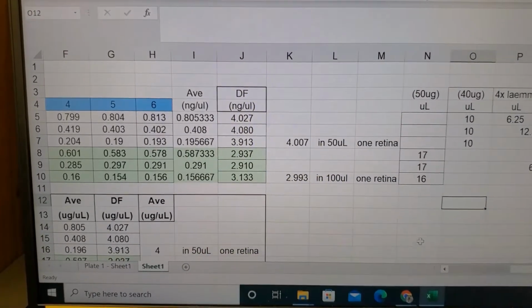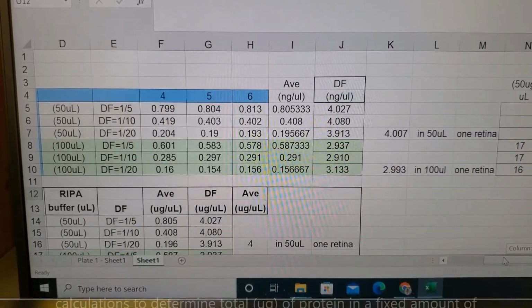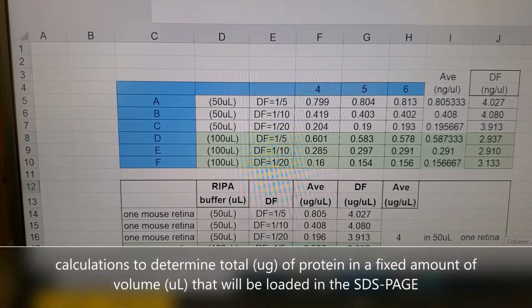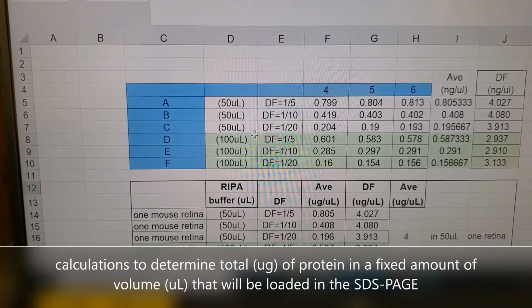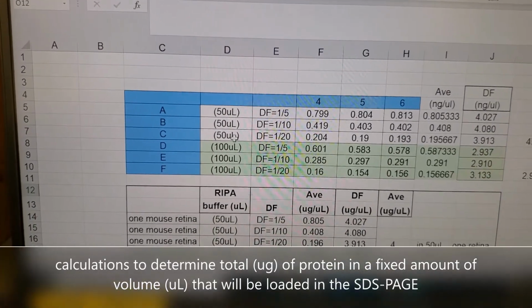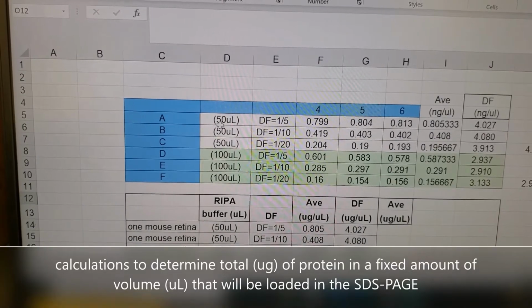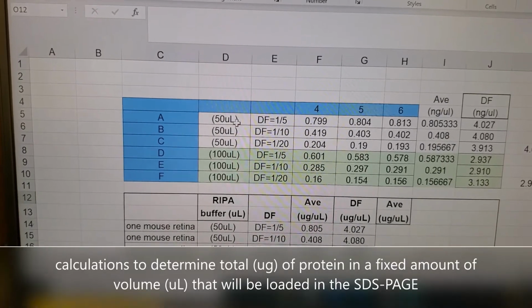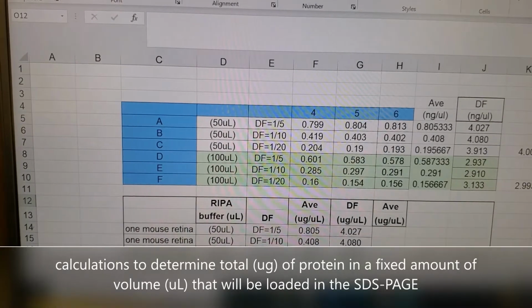So let's go over the calculations of how I prepare my samples, my cell lysates, in order to denature them. In this case, I only have 2 samples. I'm working with mouse retina cell lysates. The first one is a retina that I resuspended in 50 microliters of RIPA buffer, and in my other sample I used 100 microliters.